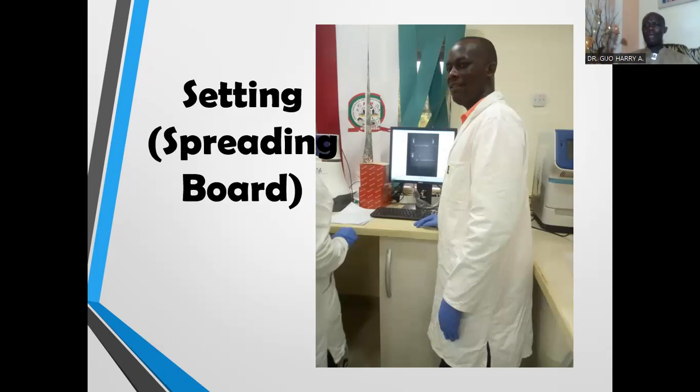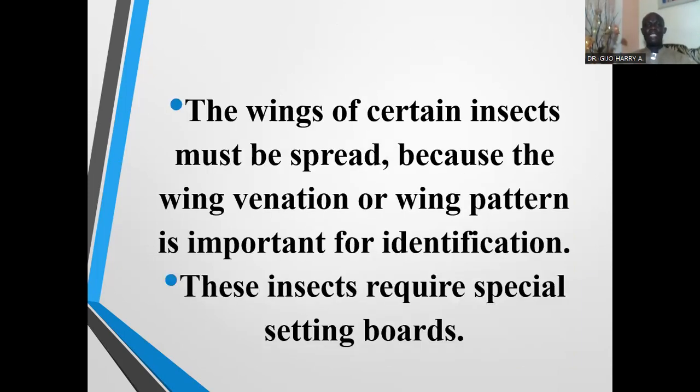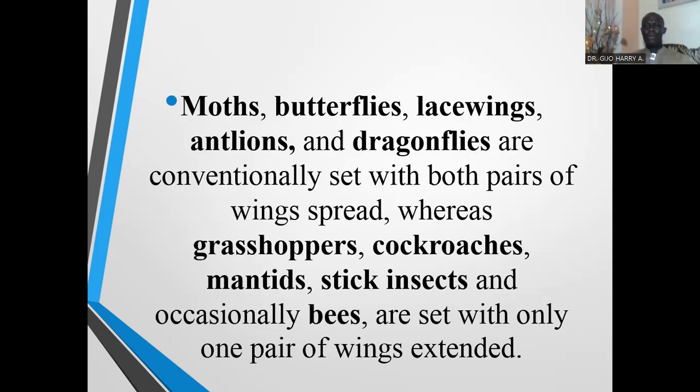The next method for mounting large hard-bodied insects is setting, or the use of the spreading board. The wings of certain insects must be spread because the wing venation or wing pattern is important for identification. These insects require special setting boards. So setting boards are used for insects whose wings are expected to be spread so that they can be properly identified.